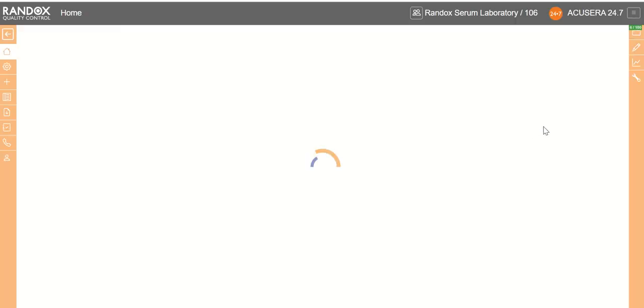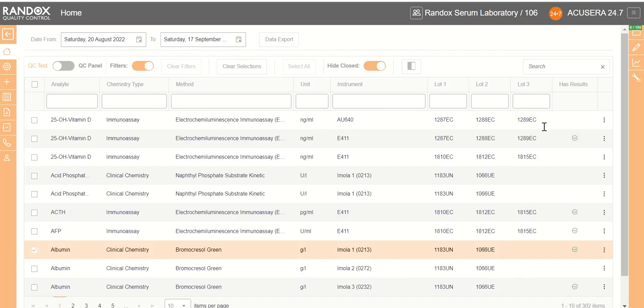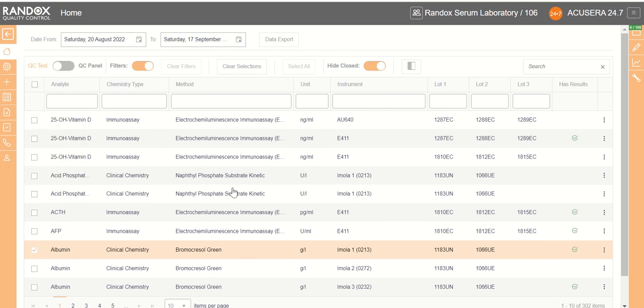Then you will be brought to the Randox AccuSera 24x7 home page. On this home page you will have the name of your lab at the top and the QC tests that you may have already loaded before.